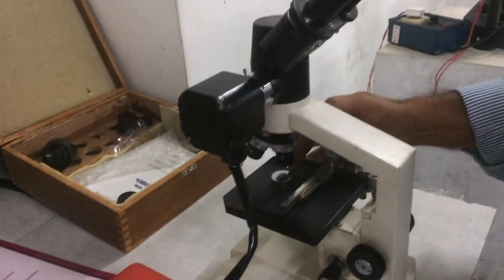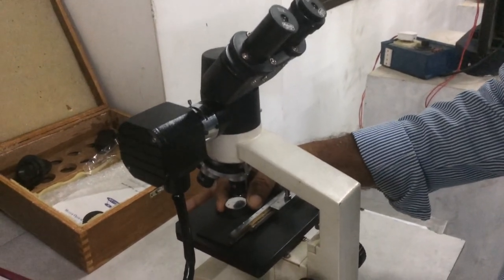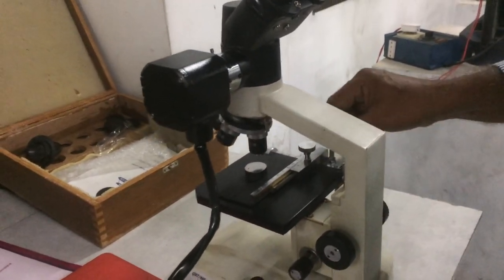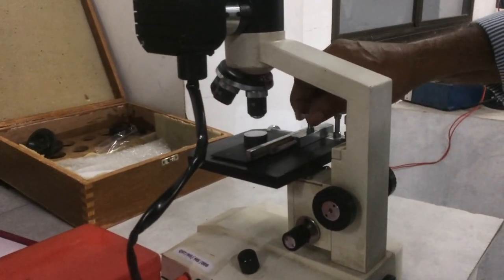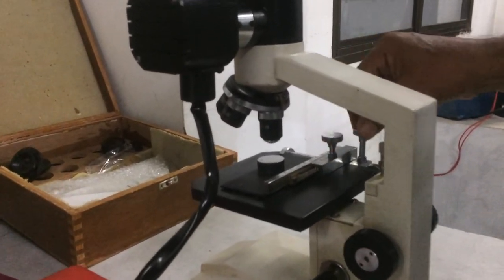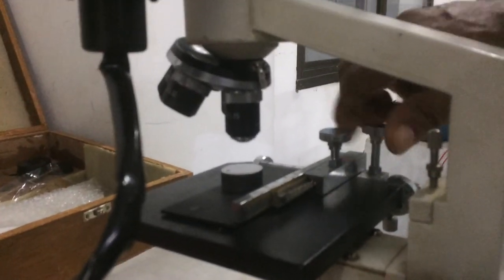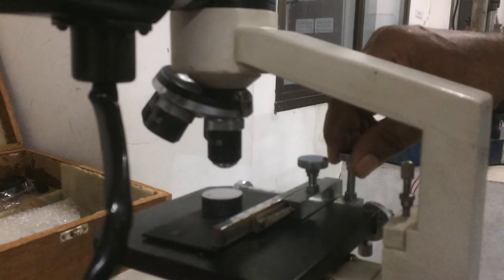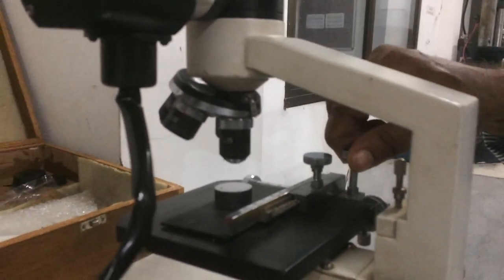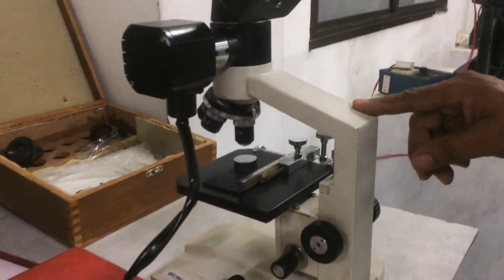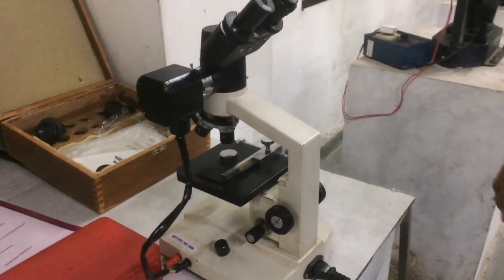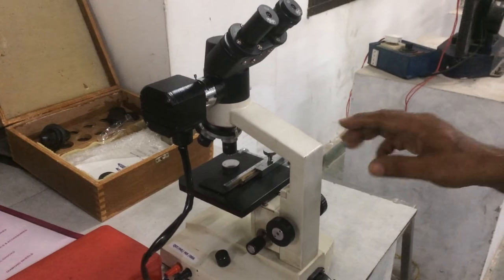We have kept the object here. So we can just move up and down. This is to move up and down. This is used for left and right. And this one is used for the forward and backward movement of the object. So this is a metallurgical microscope. During the microstructure check of a specimen we use this microscope.